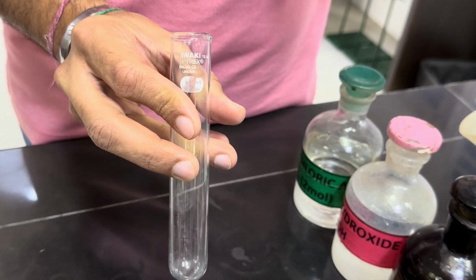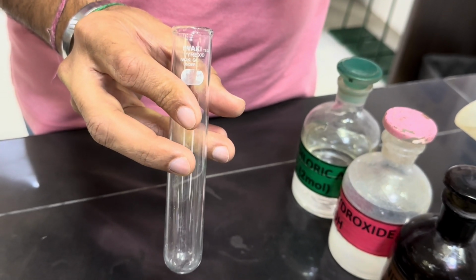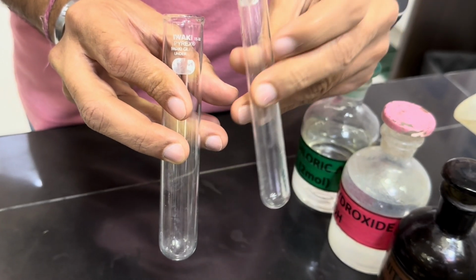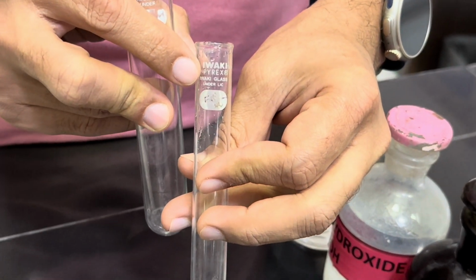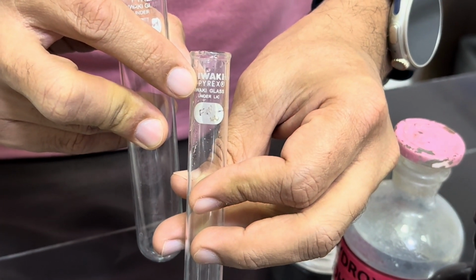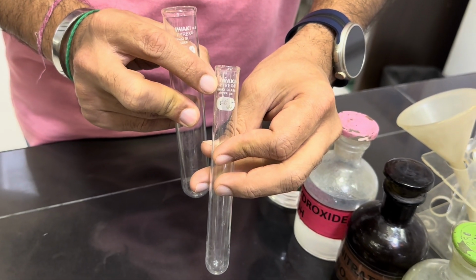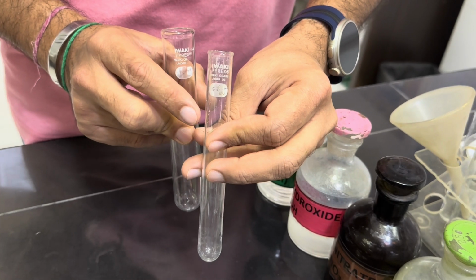So today we are using this test tube for heating, and the same test tube we use for boiling purpose also. Now we have another tube which is also made up of this Pyrex. Here you can see this Pyrex tube. So we can also use this test tube. It's a higher grade test tube. We can use this for boiling as well. So in order to save time, we will use the thin tube.